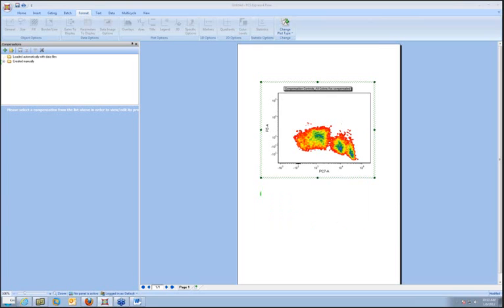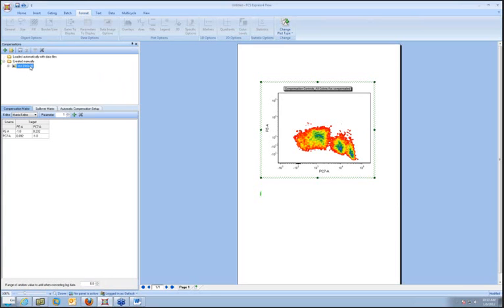To go into now a little bit about this new Navigator, you can see that I opened up the created manually section, and the test compensation that I just made is in there. You can see that it's marked as the default. If I right-click on any compensation, I can set it as the default. That's what I talked about earlier: try to use something in the FCS file, otherwise use the compensation default. You can set whatever matrix you want to be the default just by right-clicking on it. Okay, so let's look a little bit now at the bottom part of the screen.